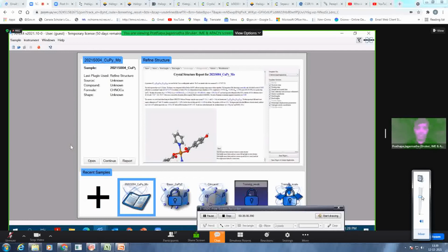You need to know whether Structure Now has added all the hydrogens properly and in the proper positions. So the final step is still left to you, and then of course you can create a report. For simple structures, most of the time you will not have problems, but make sure that you take care of that final step.